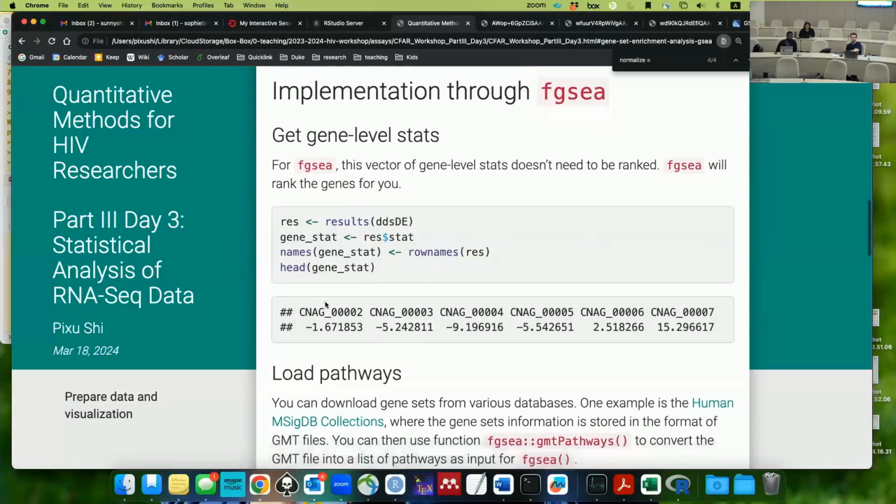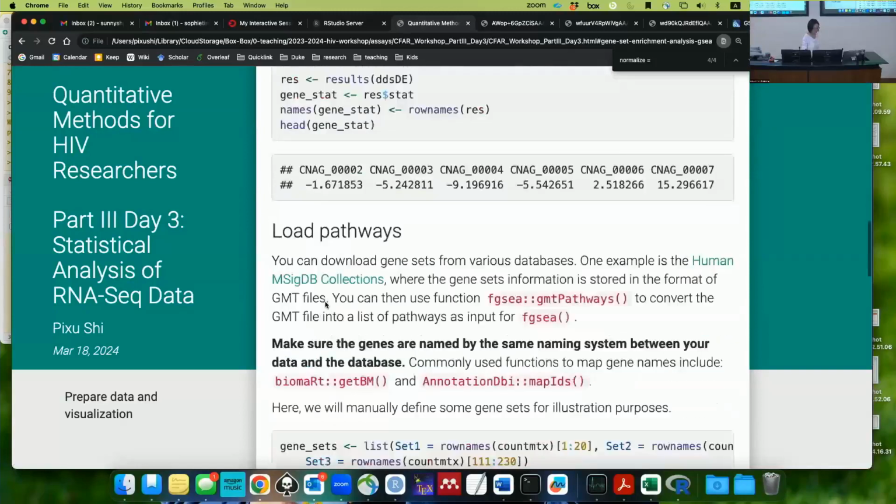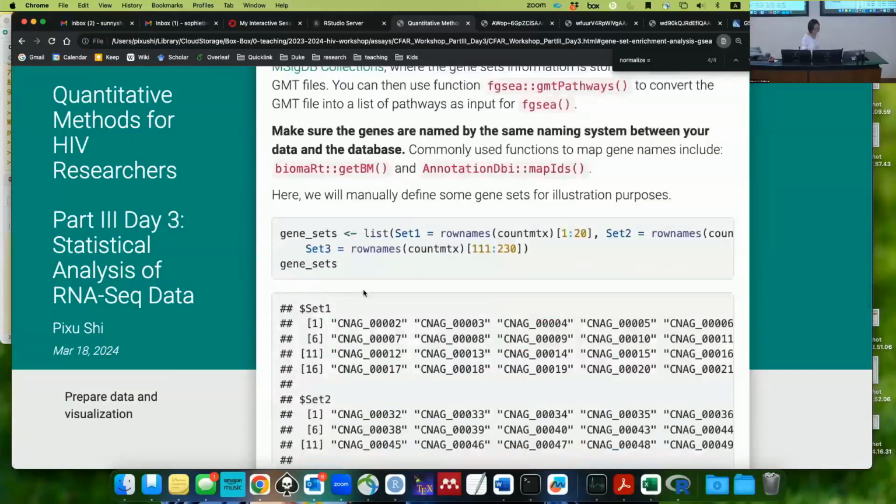The filter part is related to what enrichment method you use. The GO part is related to the database for the pathways. So you can actually use the GO database to format your list of gene sets, but still use FGSEA for enrichment analysis. Okay, so you can feed in GO and then run effectively the same code. Yeah.